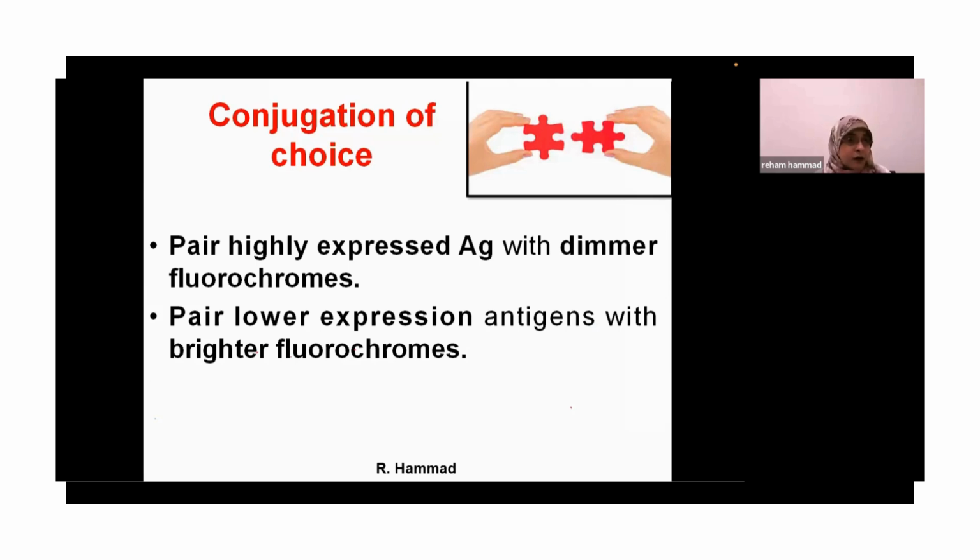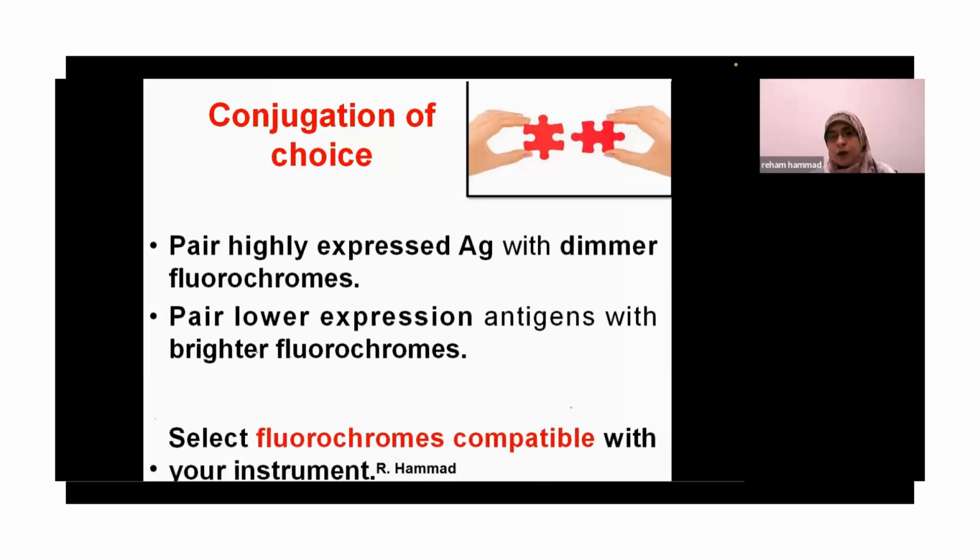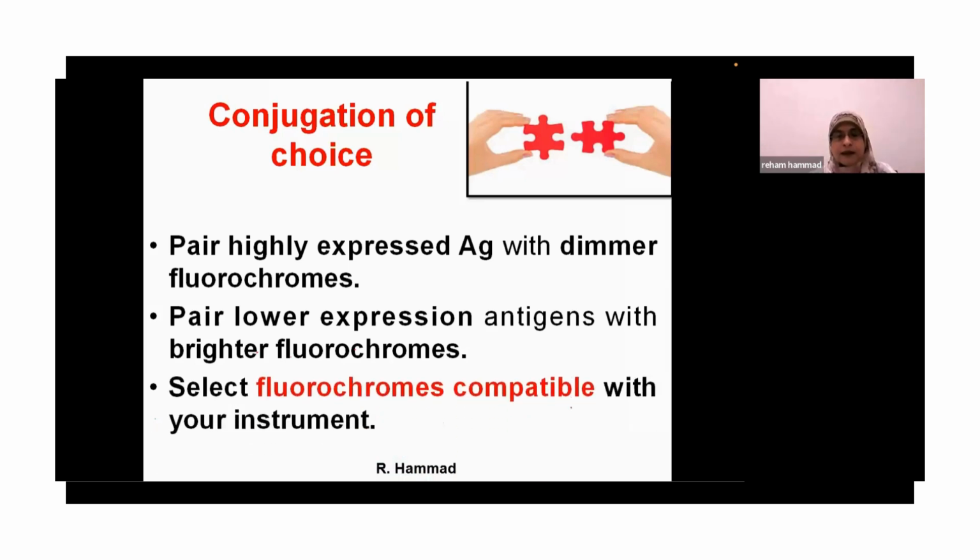The intensity of the light is not going to be low due to the antigenic density found on the surface. So this very, very simple rule is very important when you are dealing inside the lab to see whatever antigen that you are going to look for.